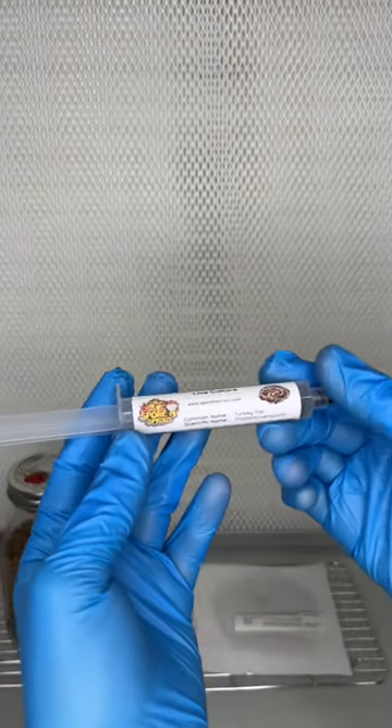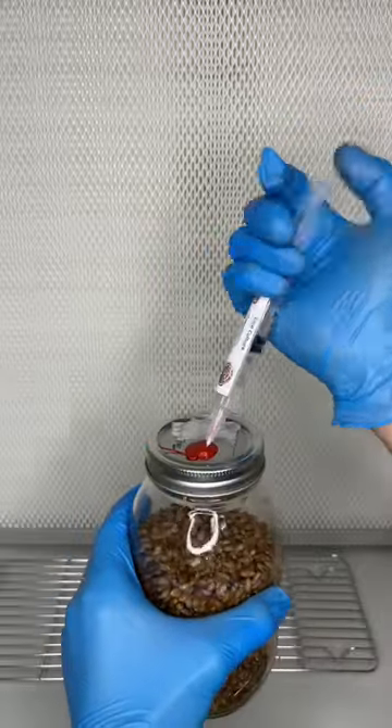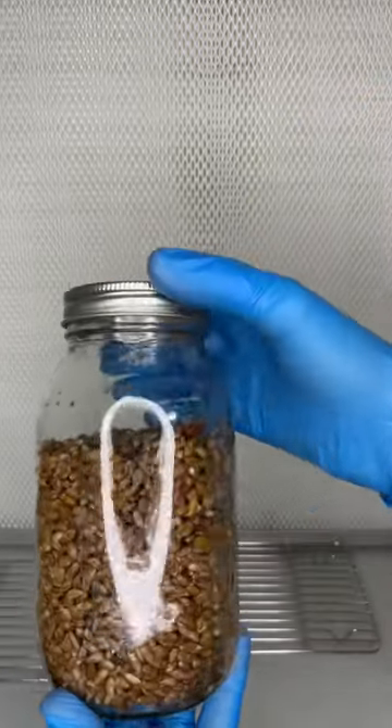This is how you can grow turkey tail mushrooms in three easy steps. The first step is to inoculate sterilized rye grain with turkey tail liquid culture.